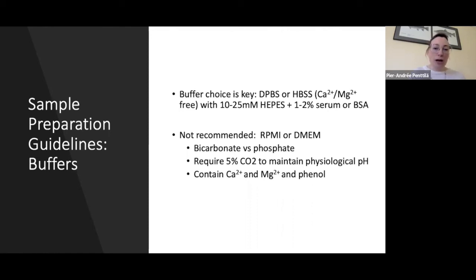And of course, the challenge here lies in balancing the fractionation of your cells in a timely way with preserving their viability, their functionality, or expansion and culture for downstream assays, for example, like cytokine production. So a prerequisite is to have a good single cell suspension that ensures the best possible flow while you're minimizing doublets, or two cells that are stuck together, for example.